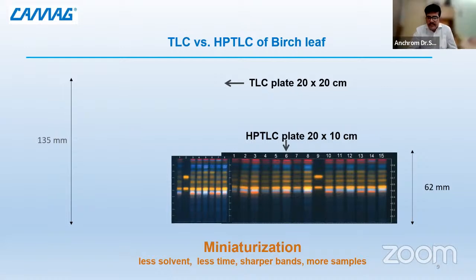So getting back, as I told you, this accounts to 4 more samples. Now, when I am in the position of a researcher, my thing is that I have many samples. I need to analyze them in a short span of time and get the results out of it. And HPTLC solves this problem. You can take lots of samples, analyze them in a very short time and get the results, because typically this size of plate takes at most 1.5 to 2 hours, and in 2 hours you are getting as many as 15 to 20 samples output. So that is the power of this technique, without bothering that anything will get damaged. And this is, I'm talking about if you are doing just one experiment.